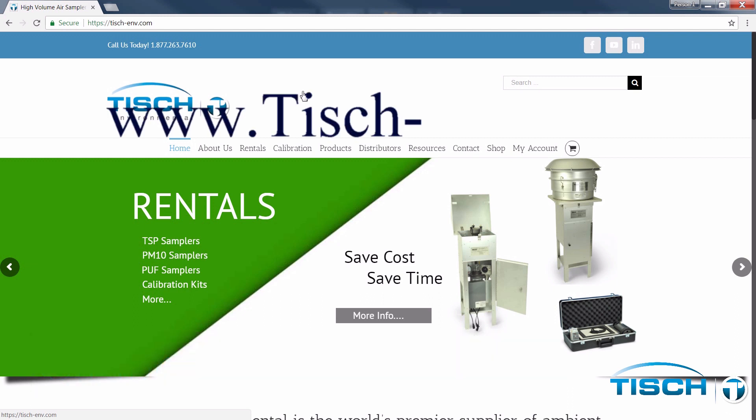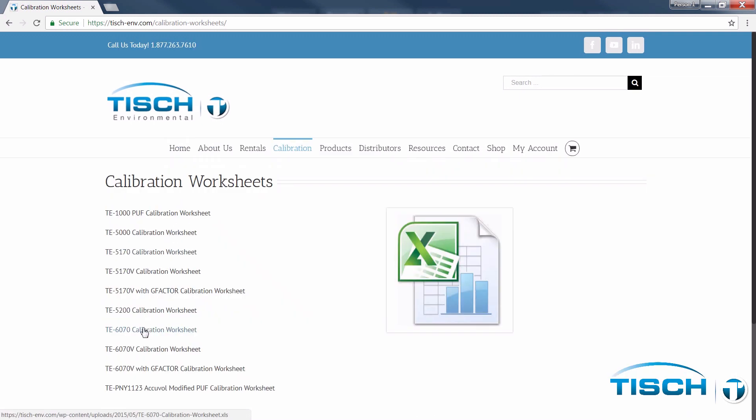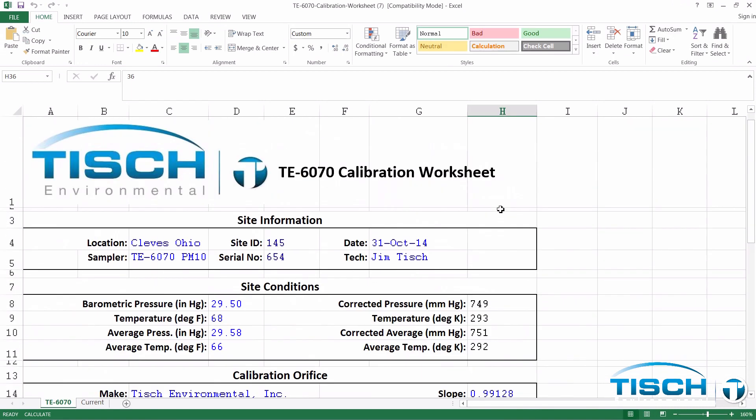Go to www.tish-env.com and select Calibration and Calibration Worksheets. Next, select the TE6070 calibration worksheet. Open the Excel spreadsheet and select Enable Editing. Scroll to the top and enter your location and site ID. Next, enter the date the calibration was performed.